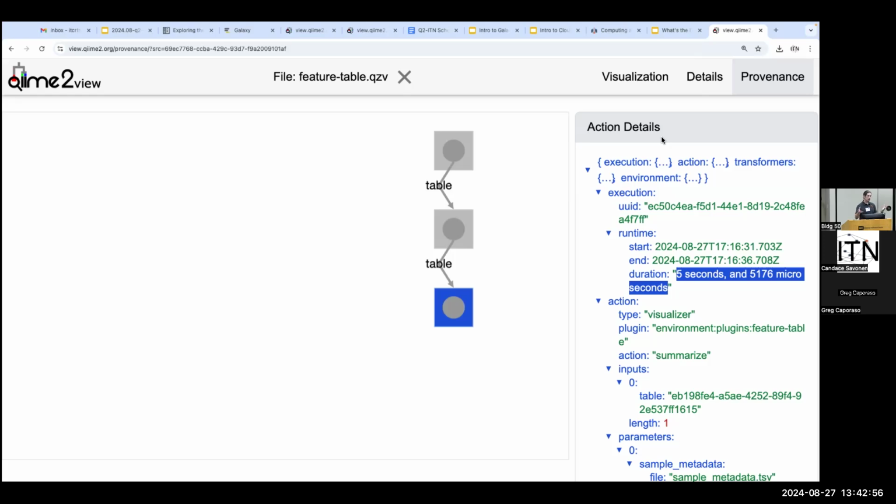So you did all your analysis and it relies on these 3 tables and these 2 visualizations, say. Put all of those in a folder, and then you run this command that we'll show you, QIIME replay reproducibility supplement. I forget exactly. What it'll do is create a zip file for you that has all of the commands that it would have taken to generate that as command line calls and as a Python script.